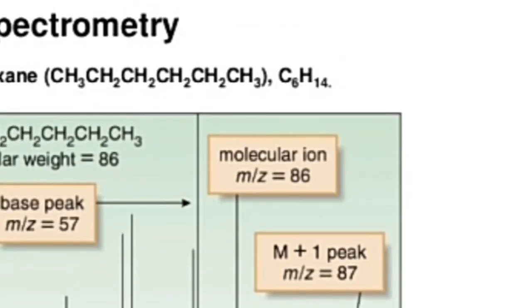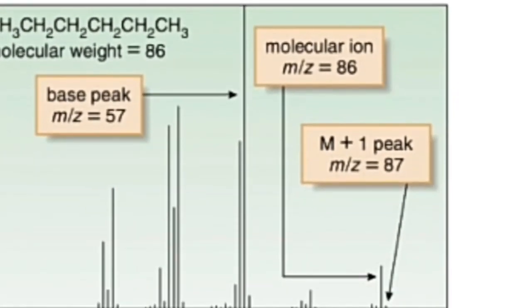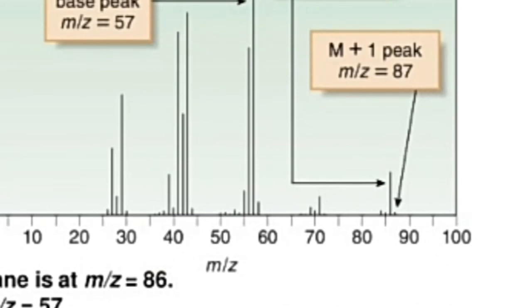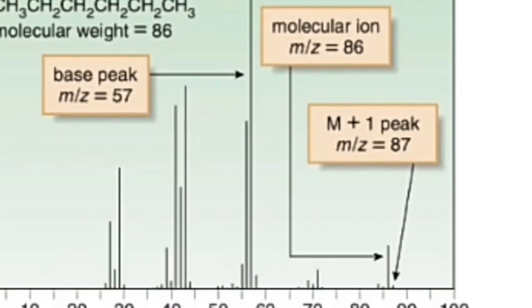This is the mass of the compound. The M/Z value of the molecular ion is equal to the mass of the molecule.